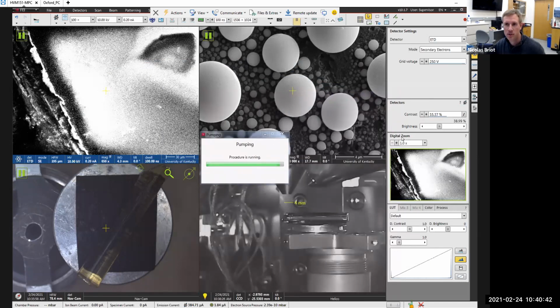It's a big chamber, so it takes a little while, a few minutes, not too bad. How much time do we have? Yeah, we have like 15, 20 minutes. Yeah, it's good. That's a good thing about EDS is you get an answer fast. Even if it's a bad answer or an answer you didn't want, you get it in 10, 15, 20 minutes.